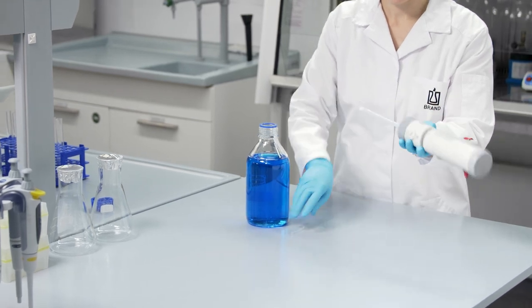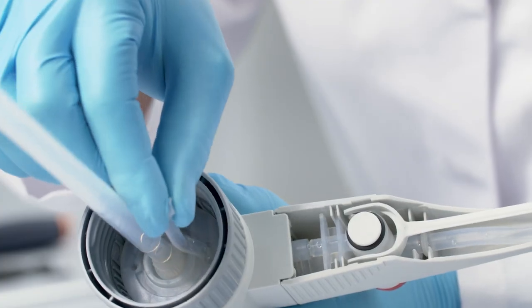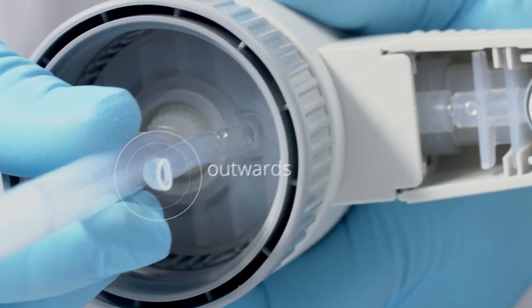If your Dispenset S is equipped with a recirculation valve, please also install the recirculation tube with the opening pointing outward.